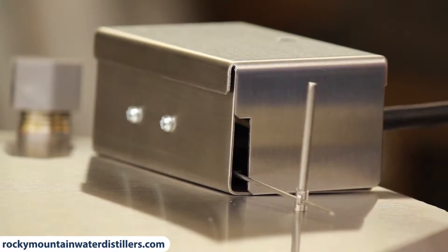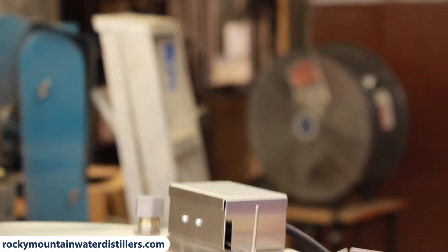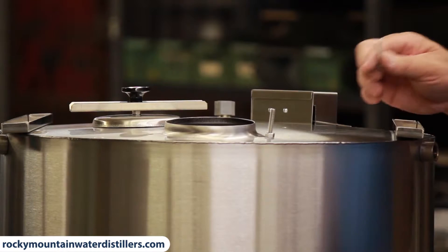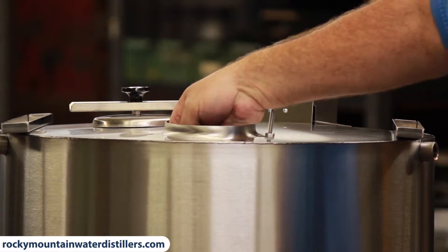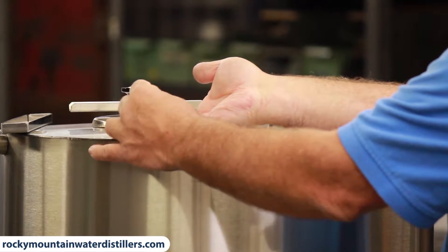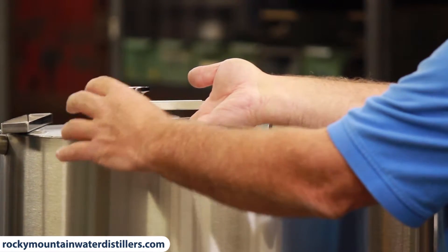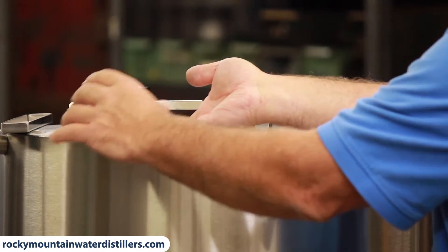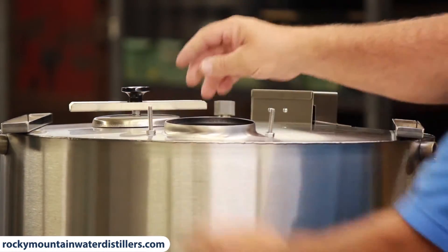This cord will plug into the back of your 42C and that will operate the distiller to turn it on and off. You also need to put your bolt up through your lid here and tighten it up, and it's ready for a lid.